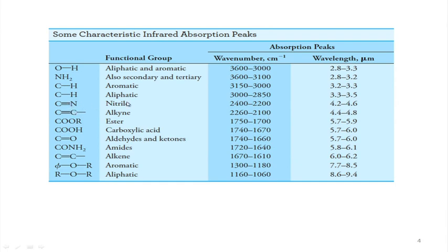Similarly, for the nitrile function, organic nitrile. Immediately when you know that a triple bonded structure is present and the organic nitrile is available, that organic nitrile can be correlated also with the presence of the cyanide function, that means CN minus, and that CN minus function can be identified in the range of 2400 to 2200 centimeter inverse.